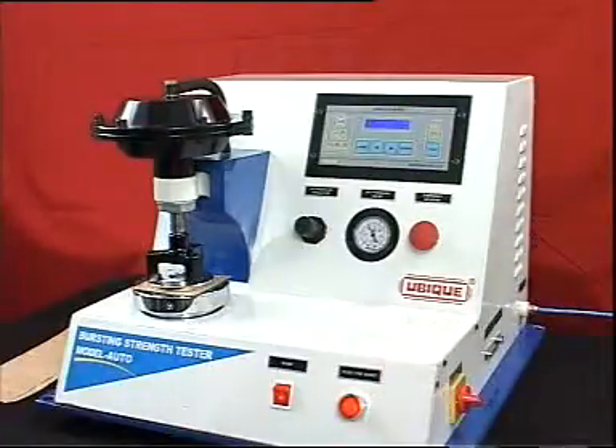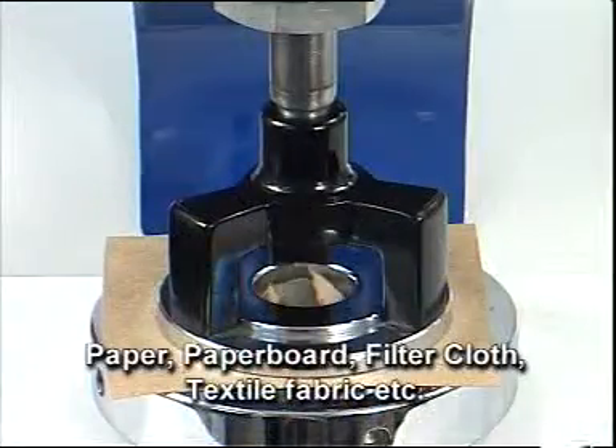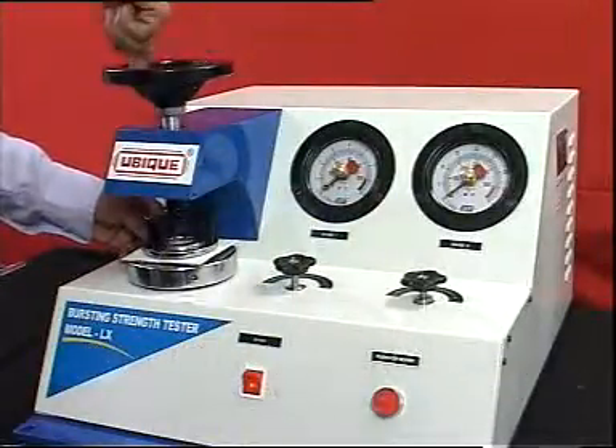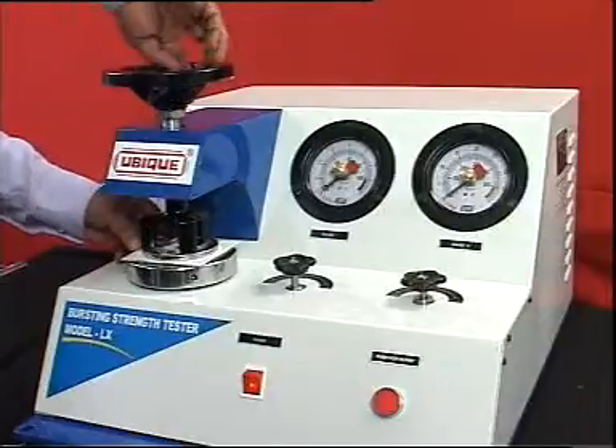Ubique bursting strength tester is suitable for testing paper, paper board, filter cloth, textile fabric, etc., as per national and international standards.